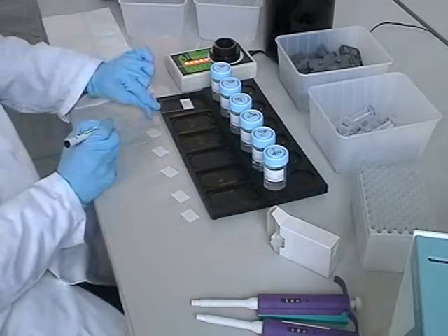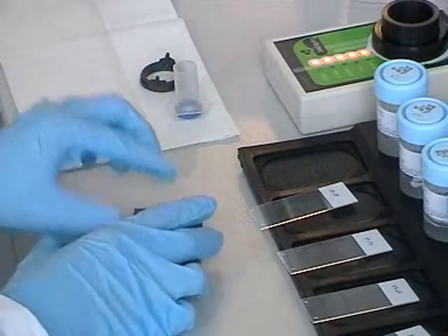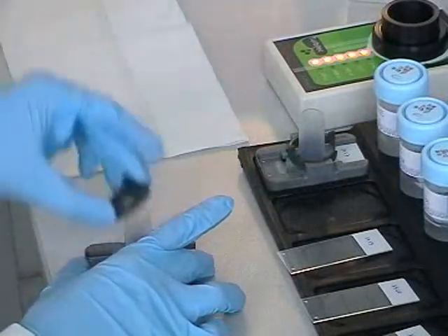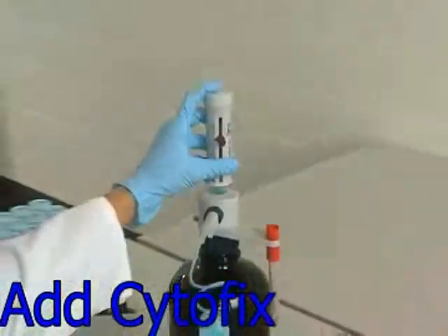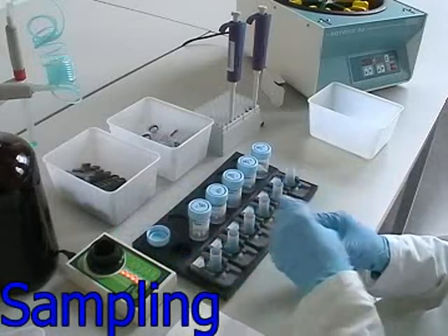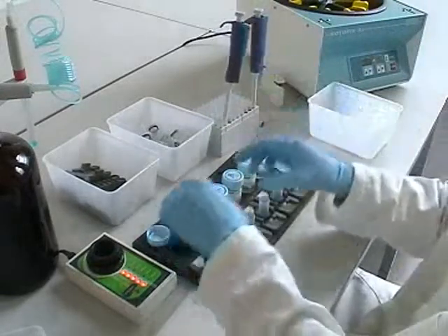Identify the coated slide by the patient number. Assemble the cytochamber with the identified slide and place it in front of the adequate patient vial. Add 1.5 millilitres of cytofix liquid to each cytochamber with the dispenser unit. Shake the vial, open the cap, and take the sample in accordance with the volume code. Pour the sample into the adequate cytochamber and discard the single-use tip.